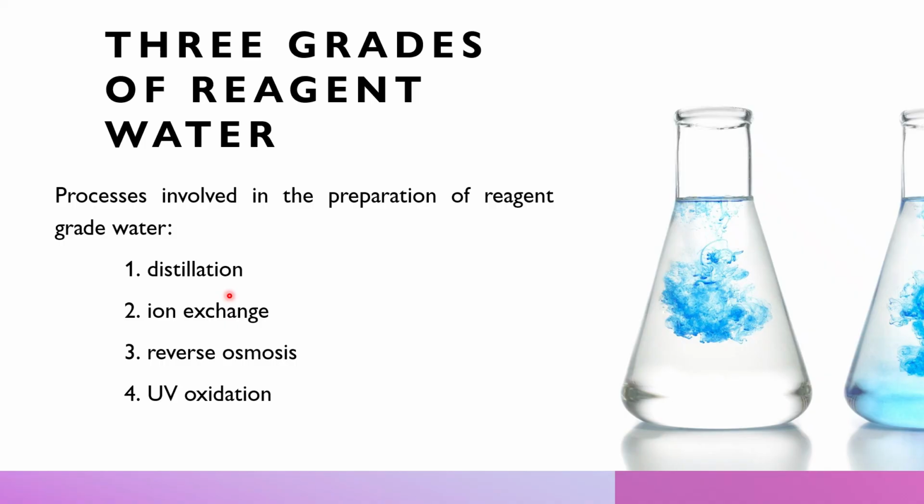Kindly write that down. Water that is purified by distillation is called distilled water, while water purified by ion exchange produces deionized water. Again, you write that down. Water purified by ion exchange results in deionized water.